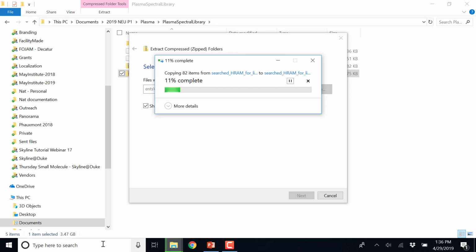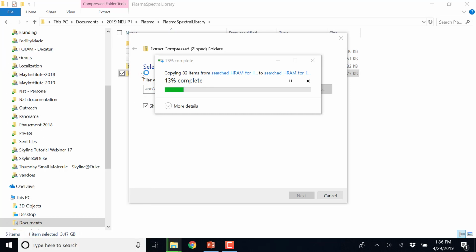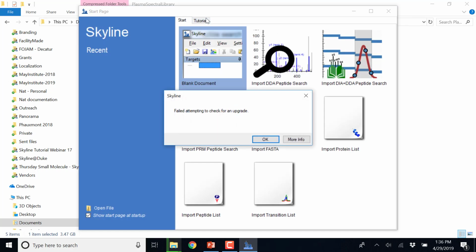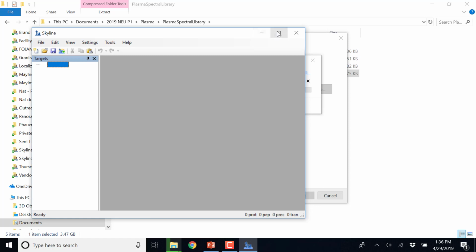Okay, so in Skyline, we'll open up, and this is where, when you're doing just familiarization and you're not particularly targeting anything right now, this is a good place to start. So we'll go, okay, blank document. All right, everybody's at least up to here, right? Okay.